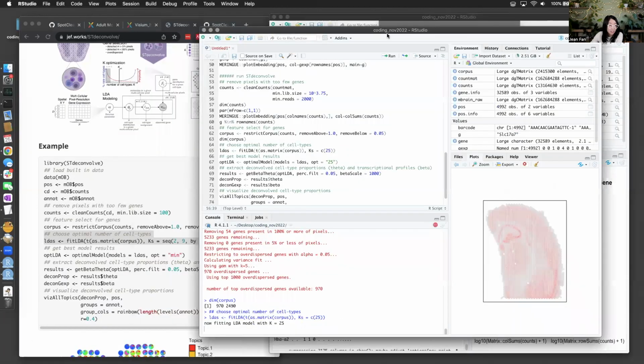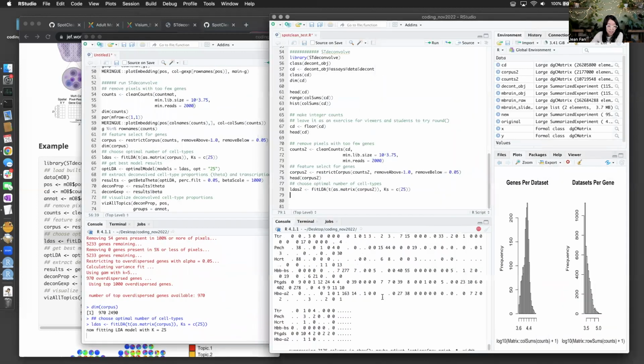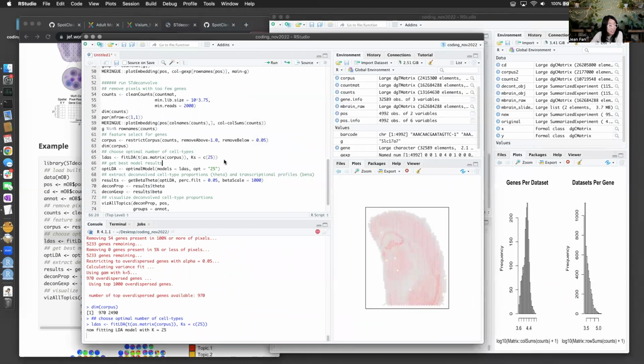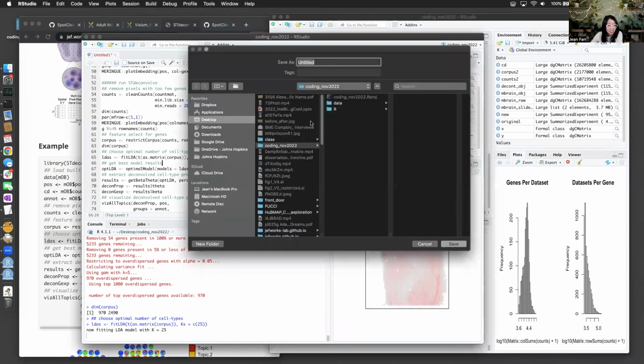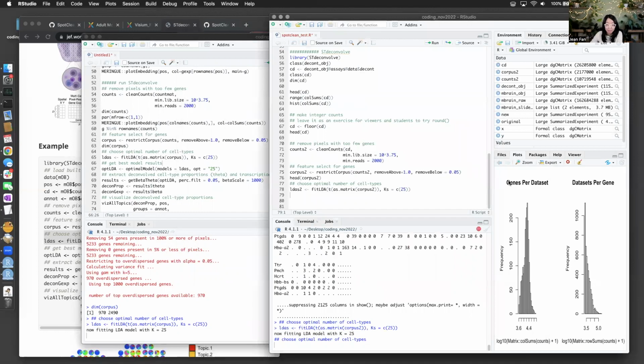Great. Now we have our 2 sets of LDA models running, and this computer is going to be working very hard to try to get us some results. And yeah, I guess we'll check back once it's done running.